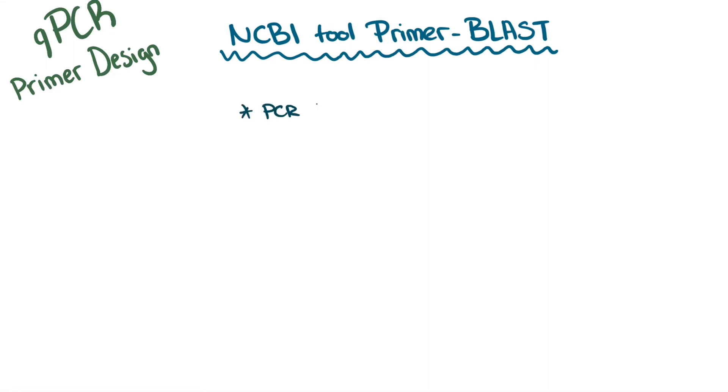For efficient amplification, design the primers so that the PCR product is between 70 and 200 base pairs long.